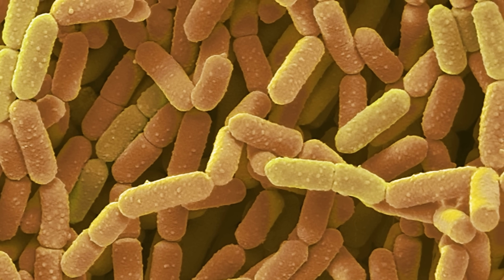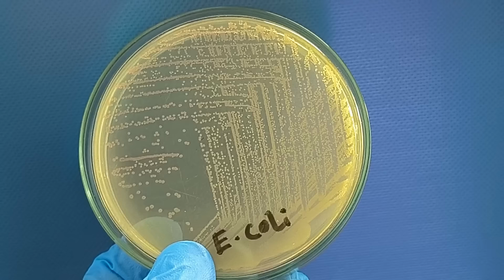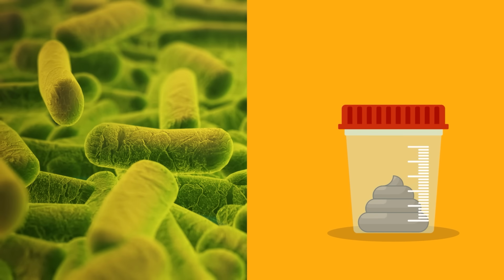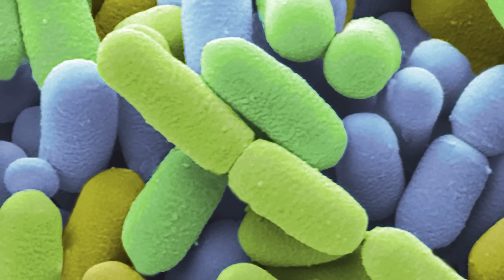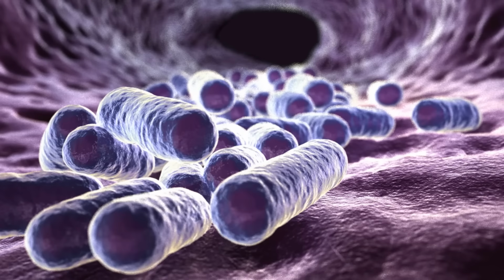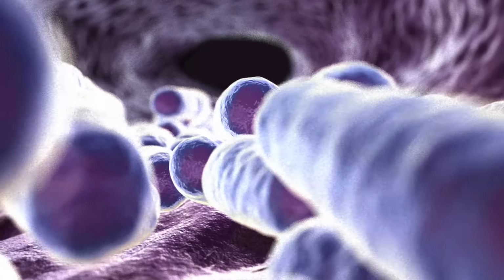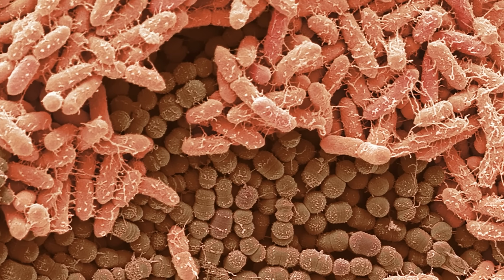Today we're going to be working with a bacteria you have almost certainly heard of before, E. coli. Now, if you've never worked with E. coli before, a brief word of warning. E. coli was isolated from a human stool sample nearly 100 years ago. As such, it's not so much that E. coli smells like poop, so much that poop smells like E. coli. In fact, around 25 to 55% of the dry weight of poop is actually bacteria, not the food you ate. So most of what comes out of you grew inside of you. Horrifying as that thought is.